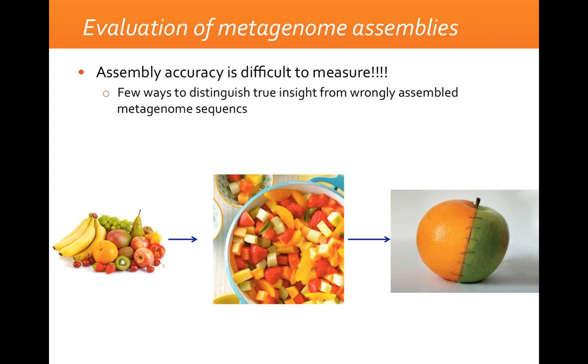Once we have assembled a metagenome, there are actually very few ways to check if you have assembled it correctly.